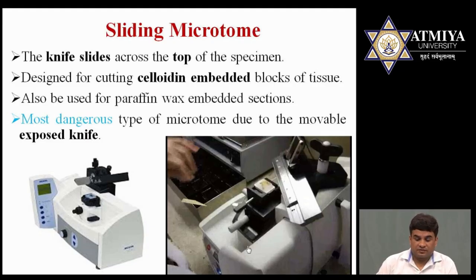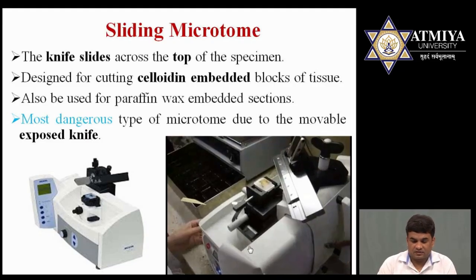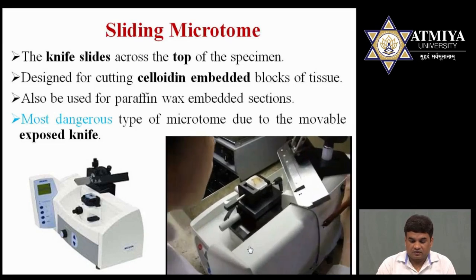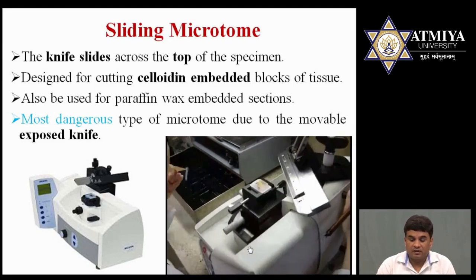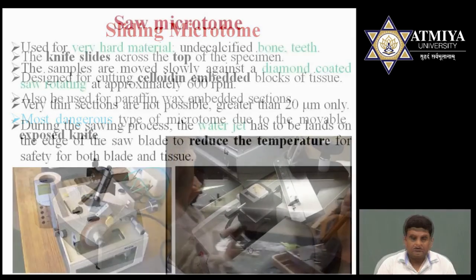You can see this video where you will get a better idea of this. So now this knife is sliding over the tissue block, right? And it gives the section.